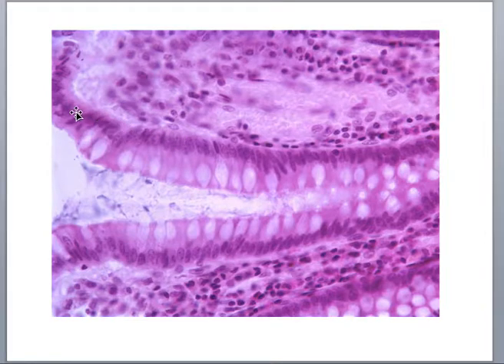So it doesn't matter what color stained slide I give you, right? You should be able to notice that there's a basement membrane, there's an apical space. So if I have the pointer along here, I'm asking an epithelial type, right? Free apical space, basement membrane. Then you should notice that it's a single layer, so simple. These cells are taller than they are wide, so they're columnar. So they're a simple columnar epithelium. This slide could be silver stained, it could be purple, it could be blue. You have to know structure, not color, okay? Identify these tissues based on their structure.